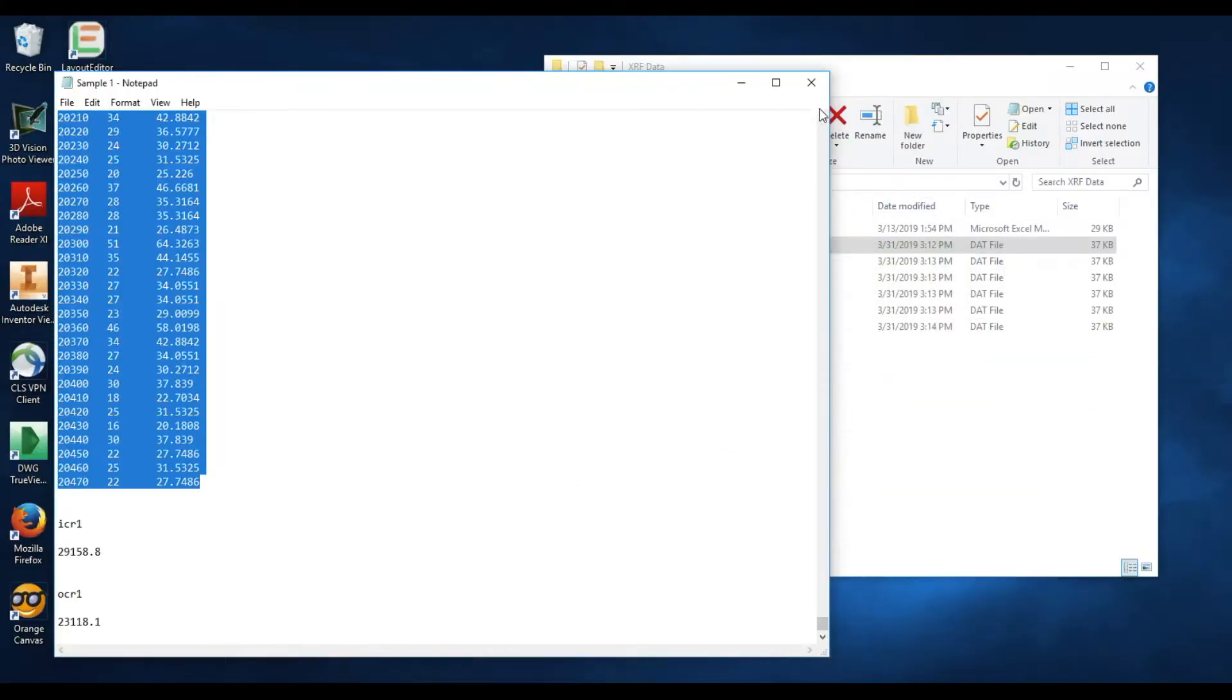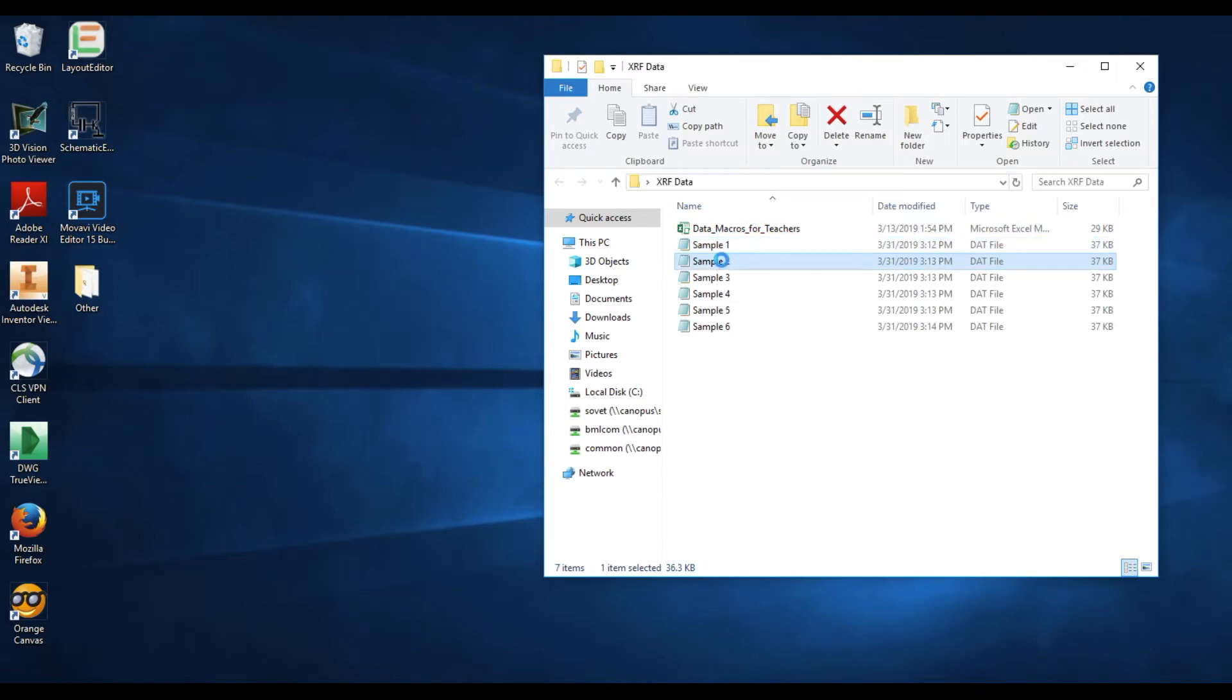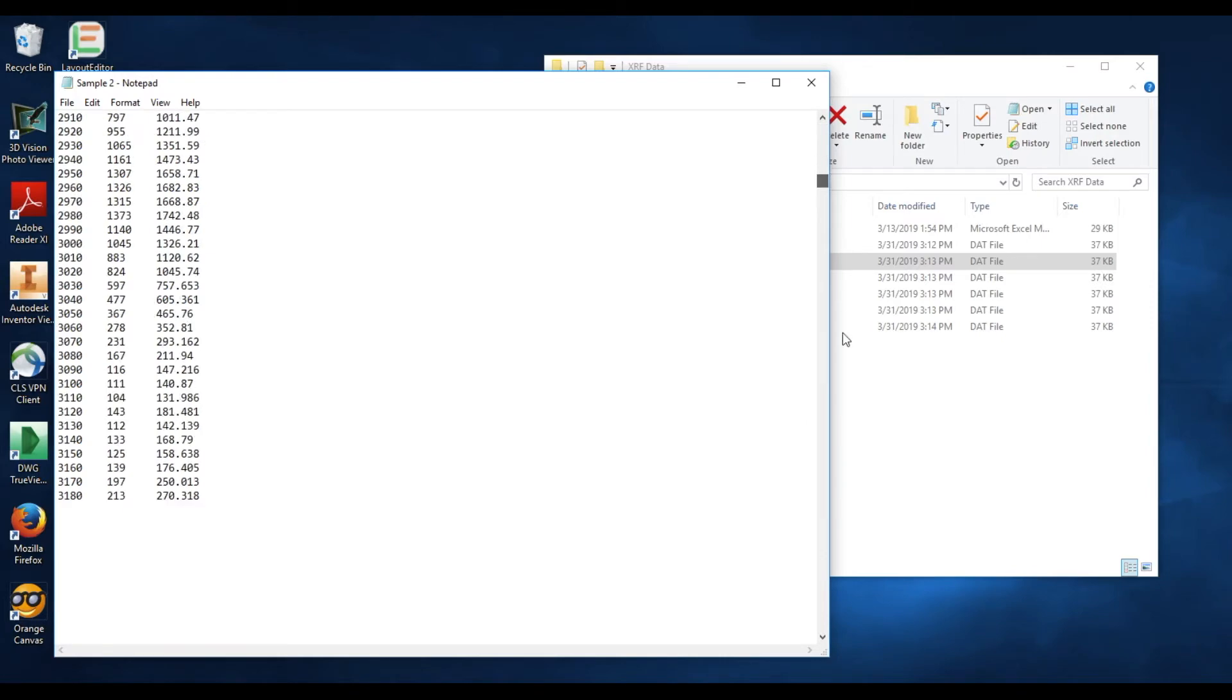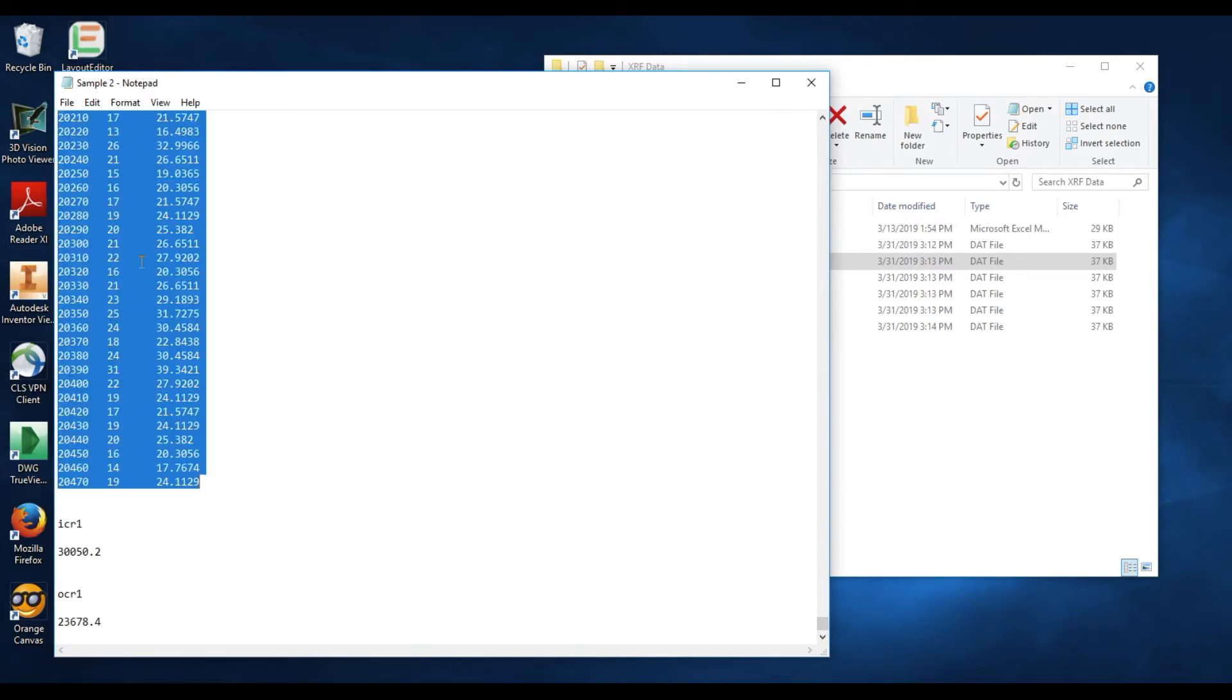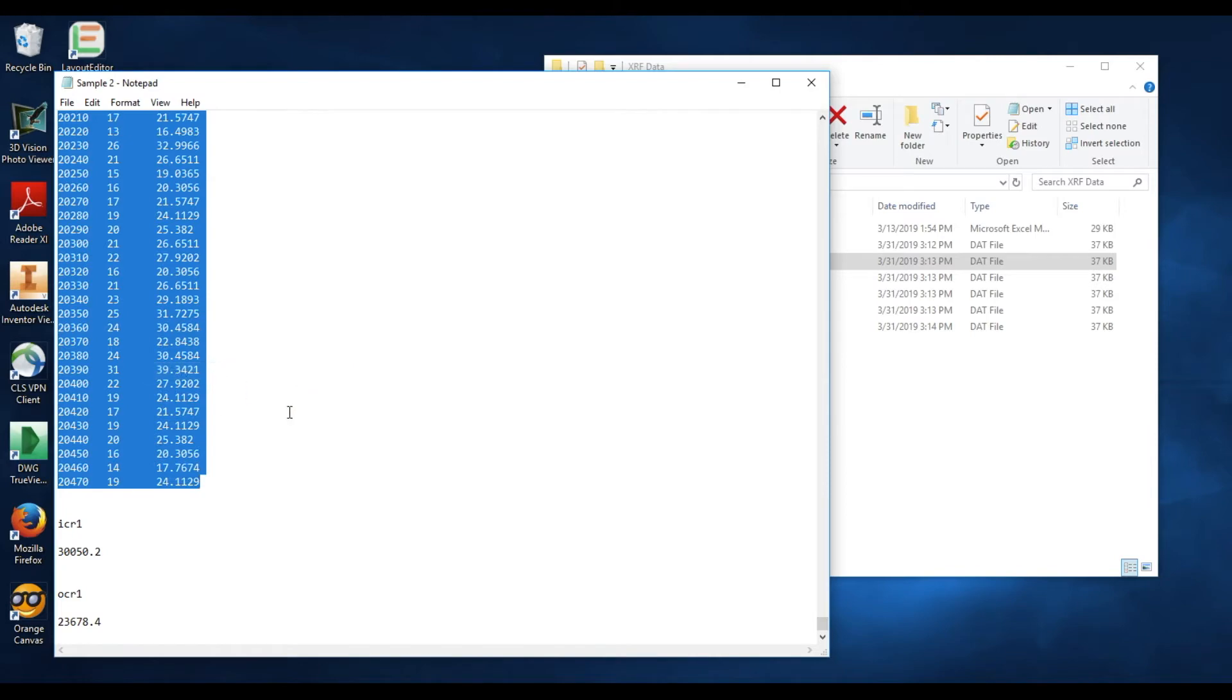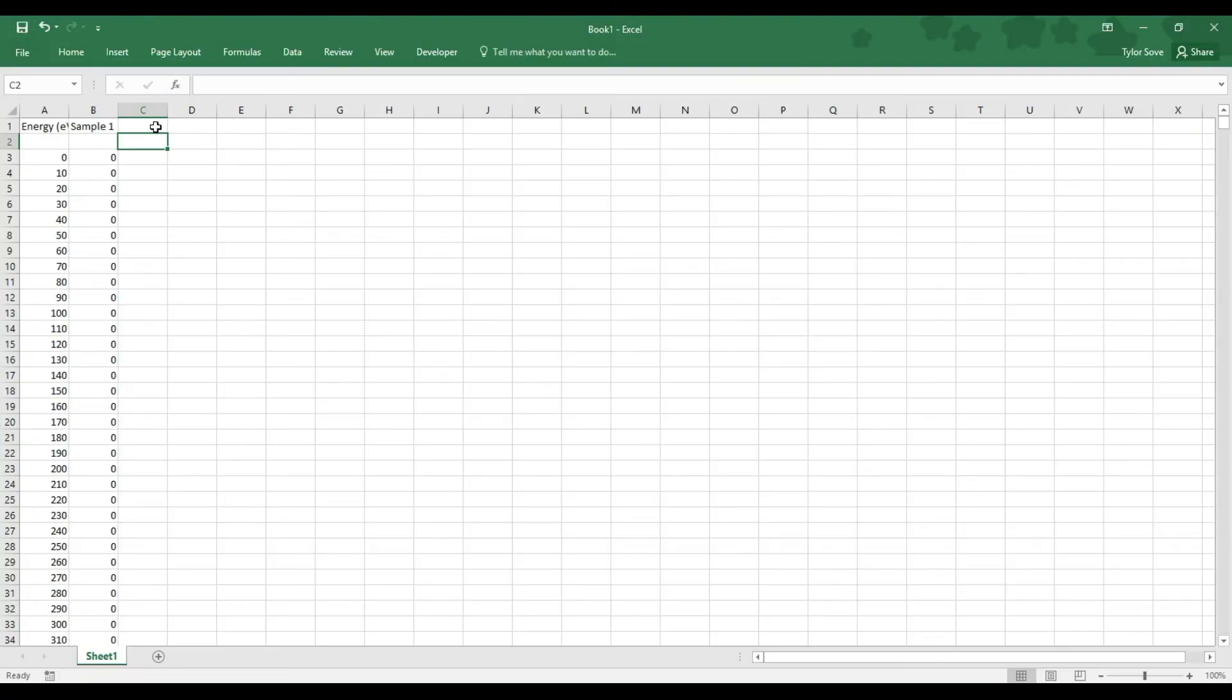Now your computer should remember which text software to select, so simply double-click the next sample file. Select just before the RAW1X again, scroll all the way down, and hold shift as you select just after the last data input, ignoring this ICR1 and OCR1. Right-click and select copy.